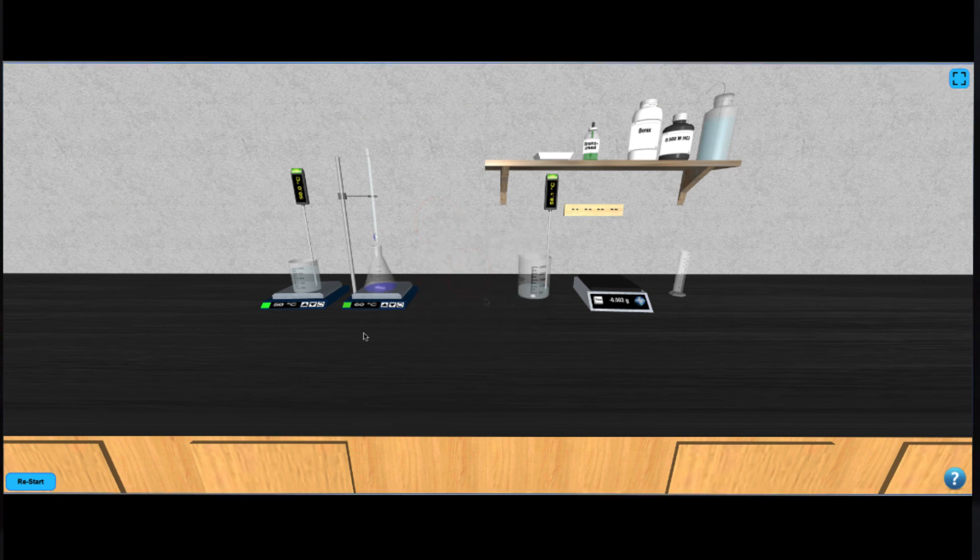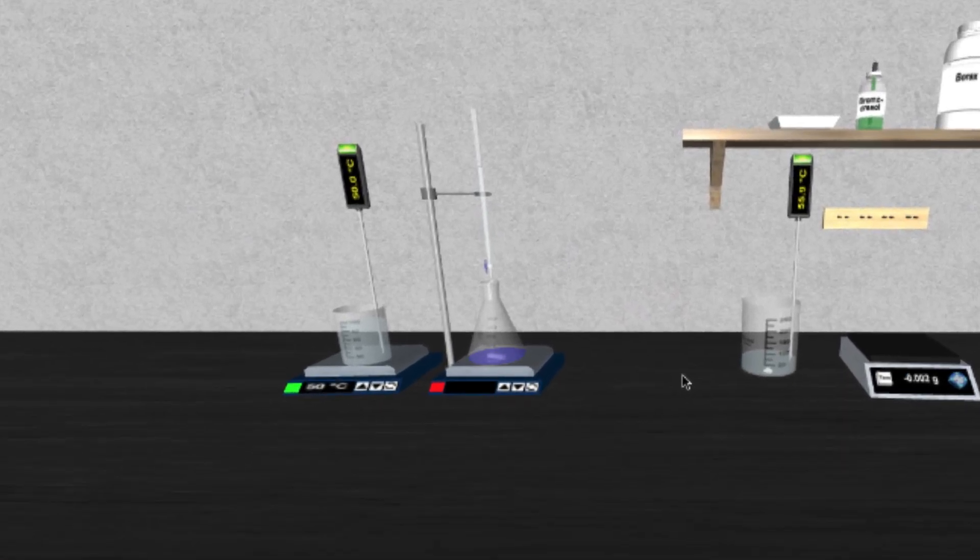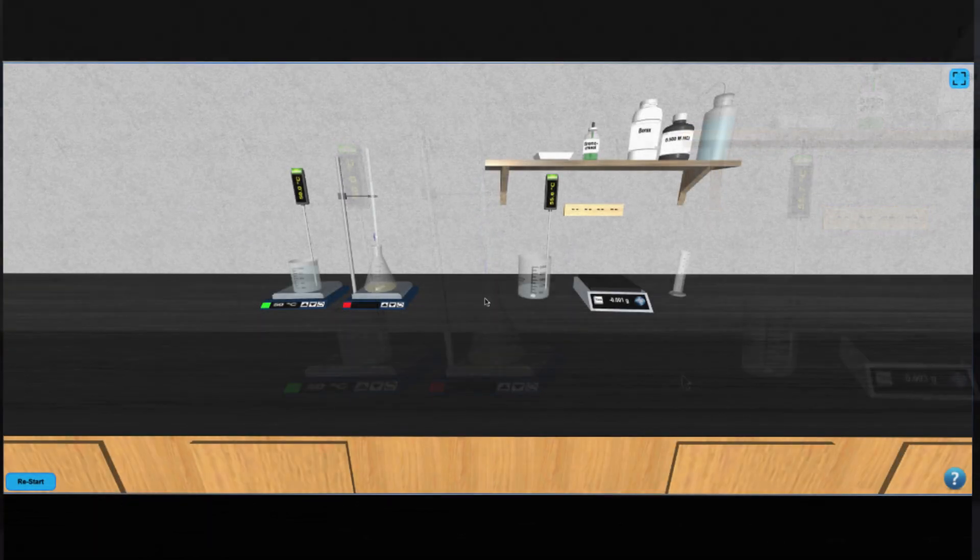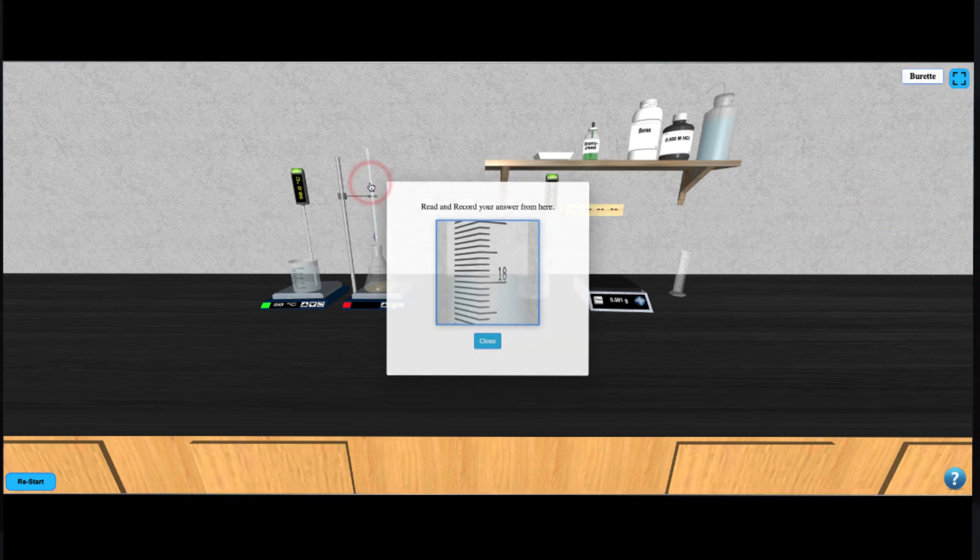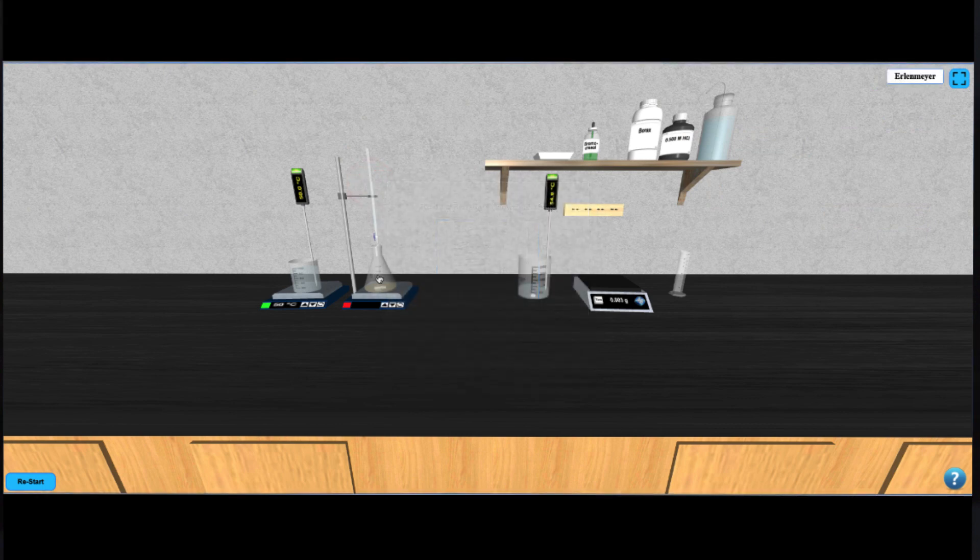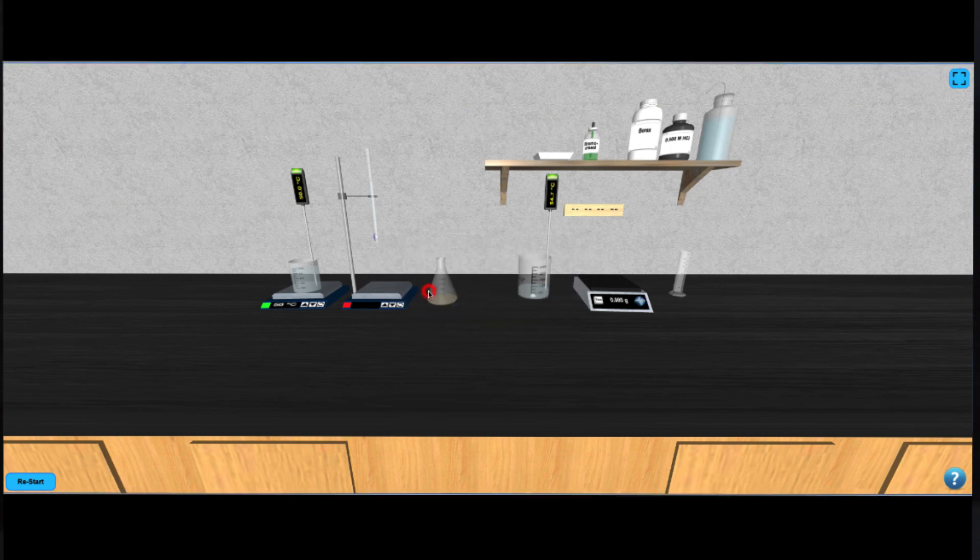Titrate the solution by hitting your down arrow key until the solution turns the appropriate color. At that point, you can zoom in to read the scale on the burette. Now you can click on the Erlenmeyer to move it back to the table and click it again to clear it.